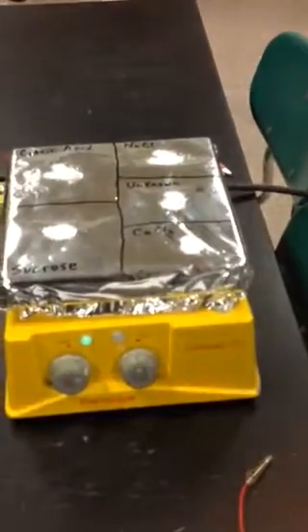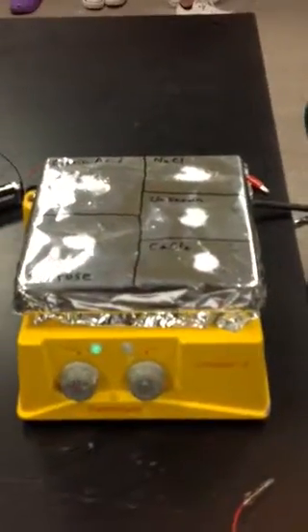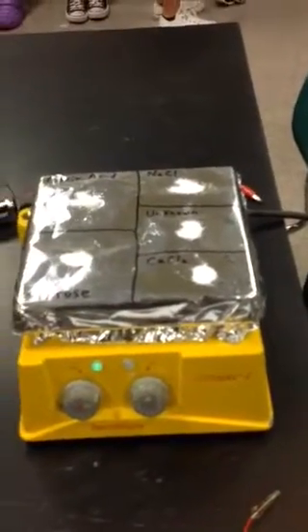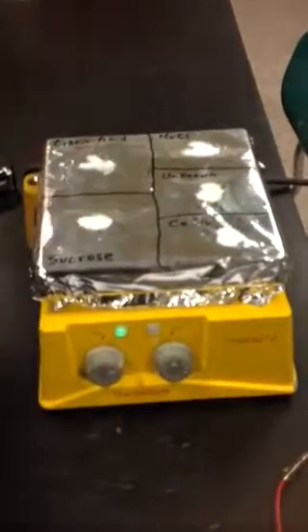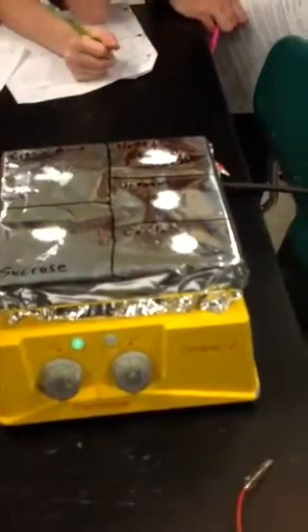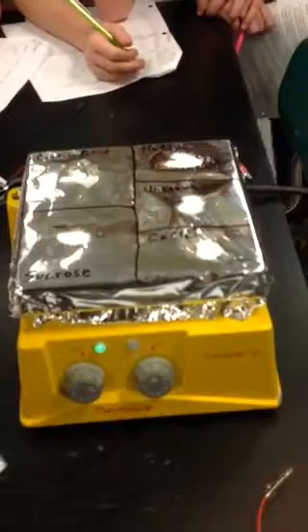Yeah, that one, citric acid. I want to see a fireball. Yeah, you can see it because it has like a little fire. You need to, folks, you need to make your observations because I'm not making them for you. But make sure you have your goggles on if you're over here. Oh yeah. Oh, that one's going too.